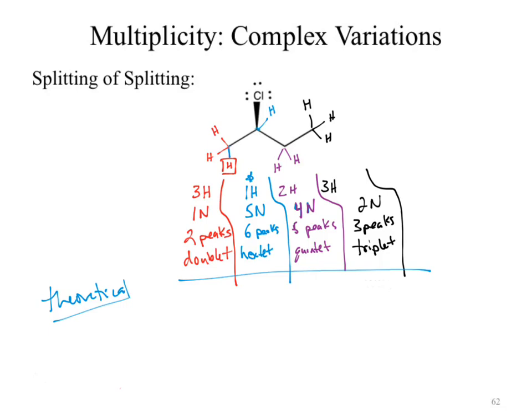When we look at the blue one, to the left we see 3 red hydrogen neighbors. To the right we see 2 purple hydrogen neighbors. In this analysis, we group those together into a total of 5 neighbors, which gets us 6 peaks, based upon our rule patterning. But are the red the same as the purple? No. And this is where things can snowball into hell. If our instrument is strong enough, it can detect the difference in the splitting between the red versus the purple.